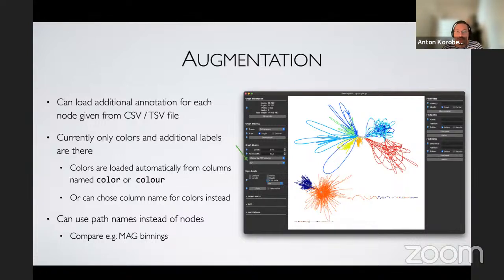So just put it here, or you could also click and use the CSV data in a particular column for the node labels. I'm showing it here as an example of MAGs, but for example, folks doing diploid assemblies have a CSV for different haplomes, and they can show whether it's the common haplome or whether there are some ploidy differences, etc.